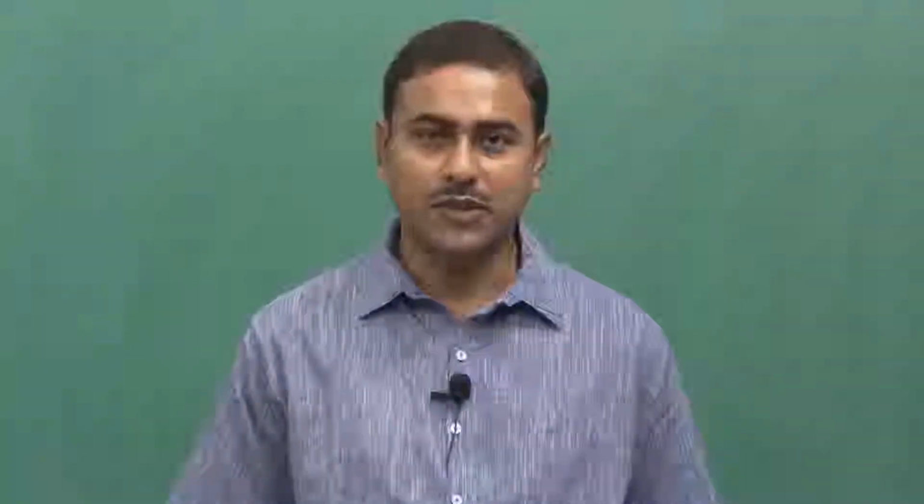Welcome to lecture number 40. In the last lecture, we discussed the total internal reflection geometry to achieve a very tiny observation volume, and we are also discussing this confocal geometry to create the small observation volume.